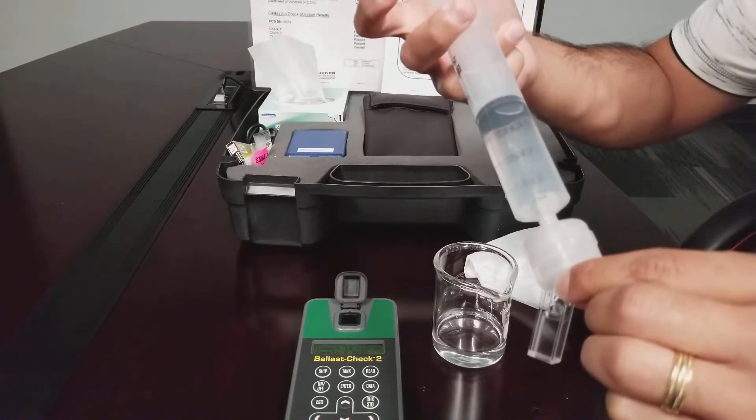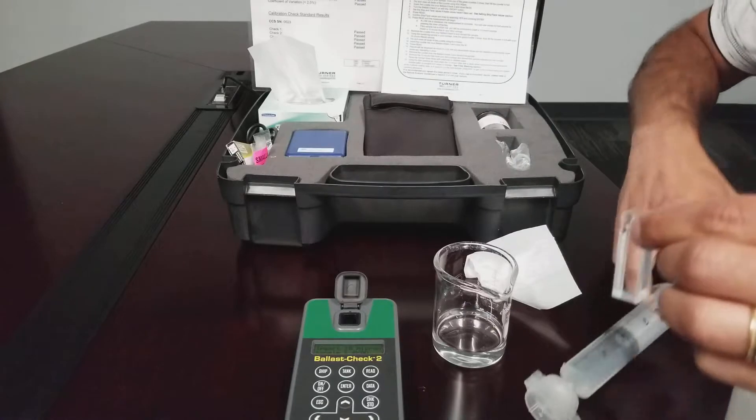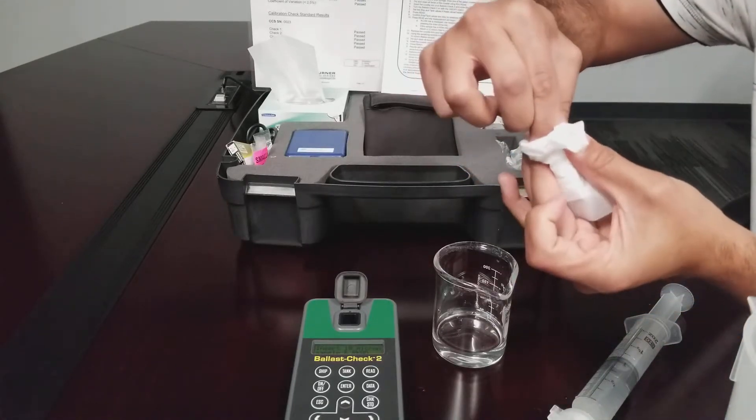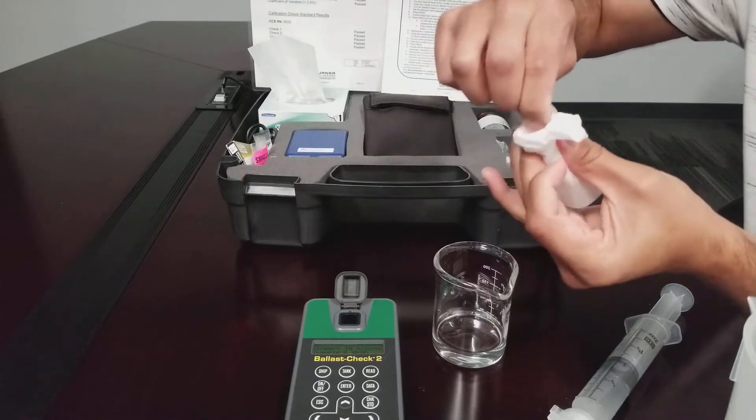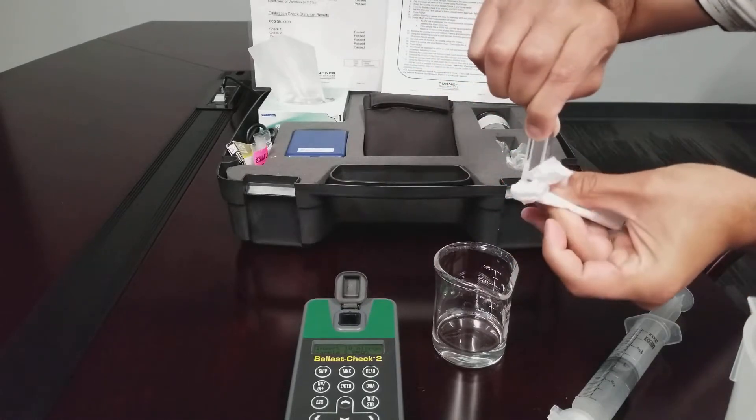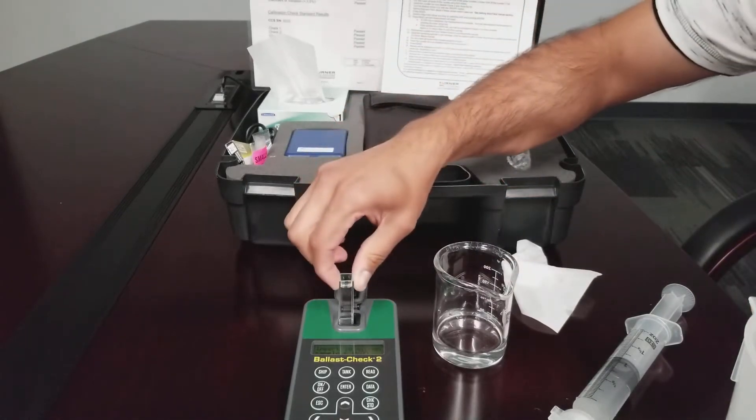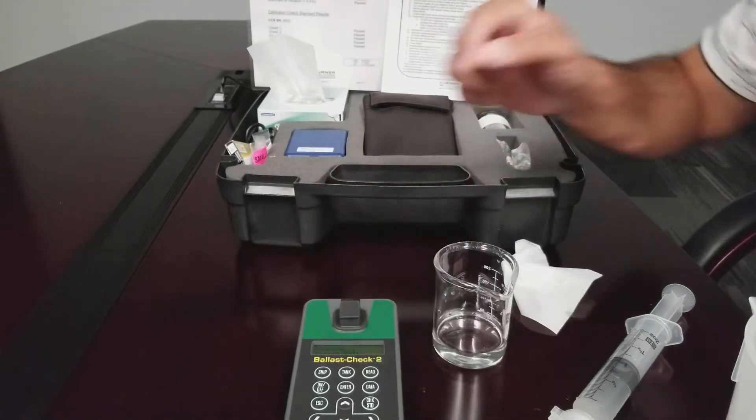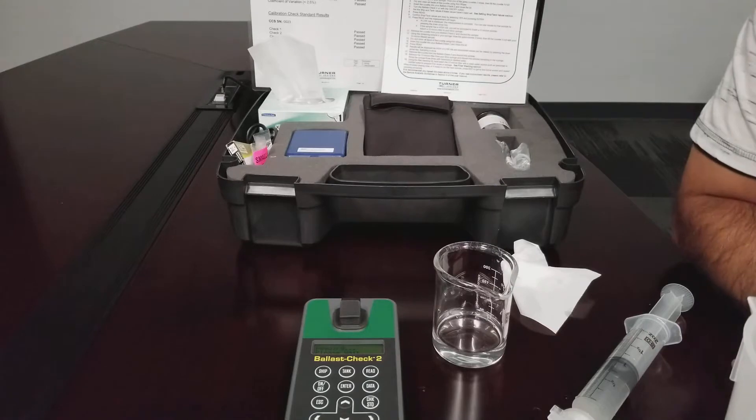Fill the cuvette three-quarters full. Use a Kim Wipe to wipe down the sides of the cuvette to remove any moisture or fingerprints. Insert the cuvette into the sample compartment. Close the lid and press read. Wait for the measurement to complete.